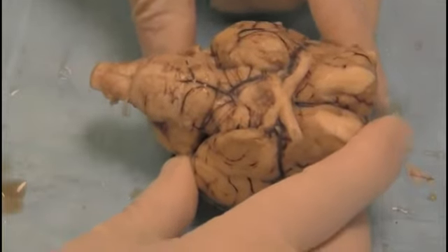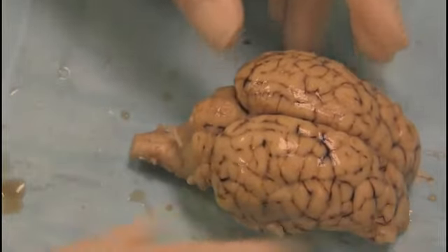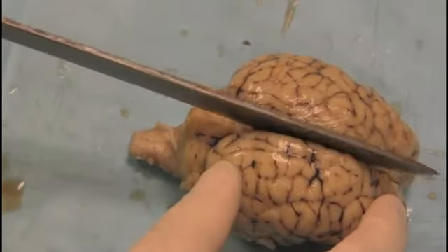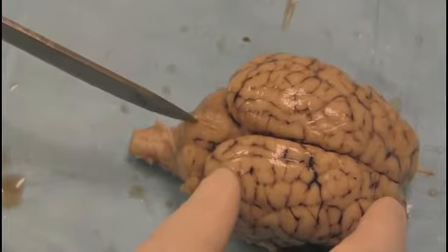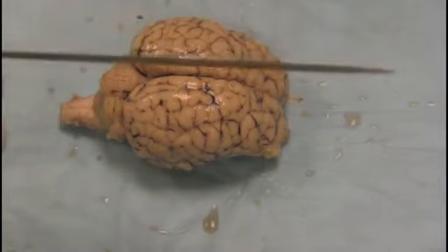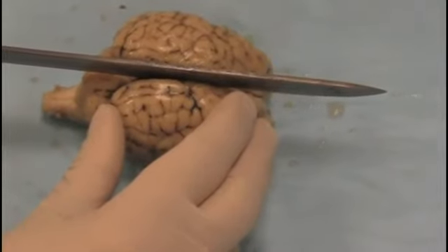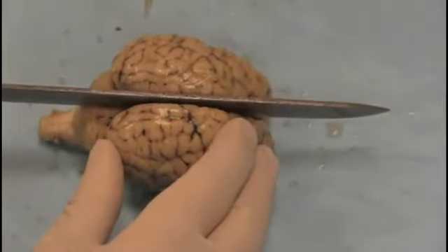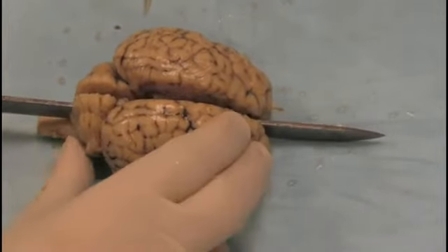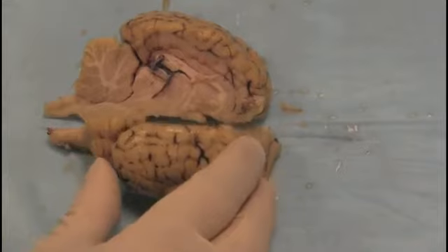Let's do our sagittal cut. The first thing I'm going to do is turn the brain over and decide where I'm going to cut. I want to go precisely down the middle and also down the middle of the central region of the cerebellum called the vermis. I'm going to place the knife in position and then cut. It's important to cut cleanly in one stroke if possible. I'm pressing down firmly — and very nice.